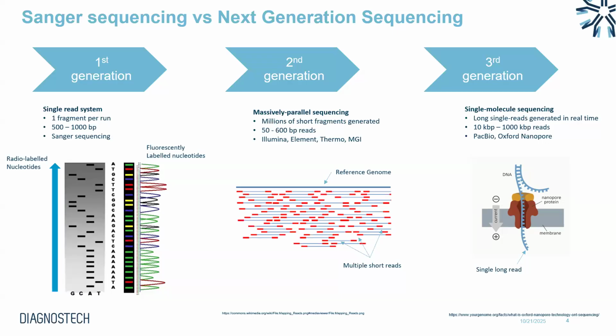So you commonly hear NGS referred to as massively parallel sequencing, and this is due to the way that data is generated. During the sequencing reaction on board the instrument, millions of biochemical reactions occur simultaneously to produce sequencing data. And depending on the platform used, reads produced in a single run can be greater than 1 billion. The biggest difference is that genetic information can be simultaneously captured for multiple genes, compared to Sanger, in which each reaction captures information for only a single region.